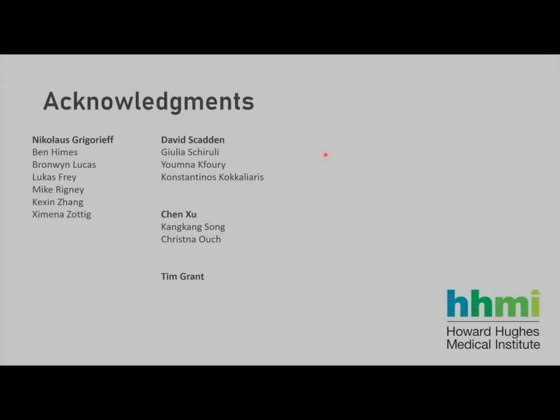Thank you. So, very nice talk. I just want to ask, in this Rigauer paper, they first said that defocus should be really low for high precision location of particles. But then in this last paper from Lucas, they told that it actually doesn't matter. But you told again that the defocus should not be that high. So what's your take on it?